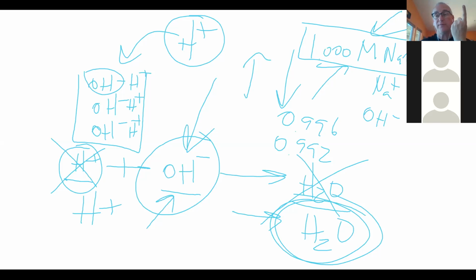And so the first part of the experiment is to determine precisely what my amount of sodium hydroxide is by basically titrating it. Can someone tell me what titrate means? What's the meaning of that word, titration? Exact volume of one substance is reacted with a precise amount of another substance. Yeah, more or less. But it's particular for an acid-base reaction.